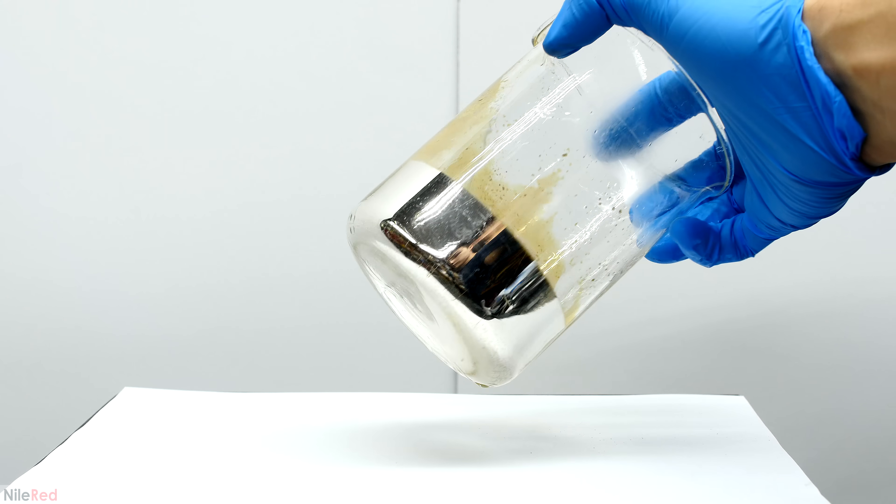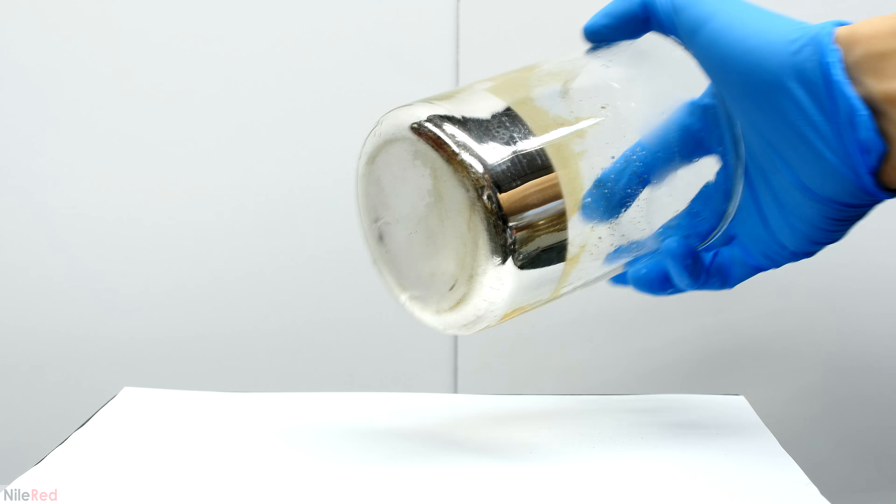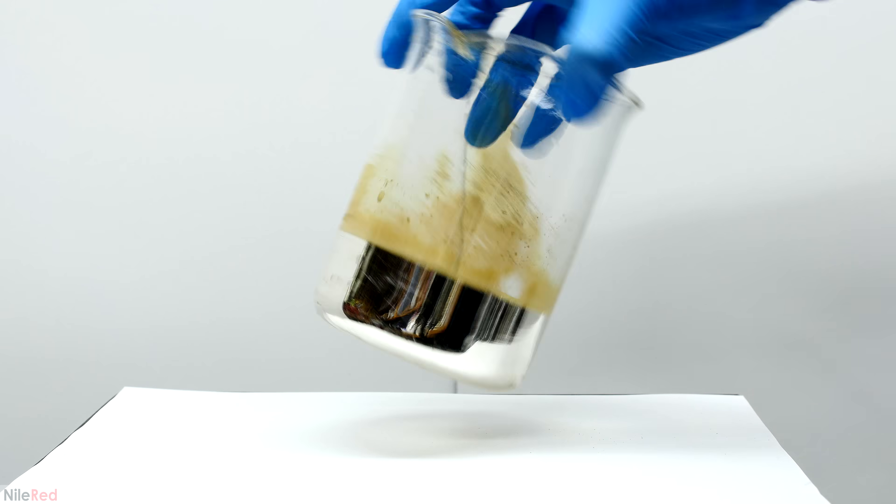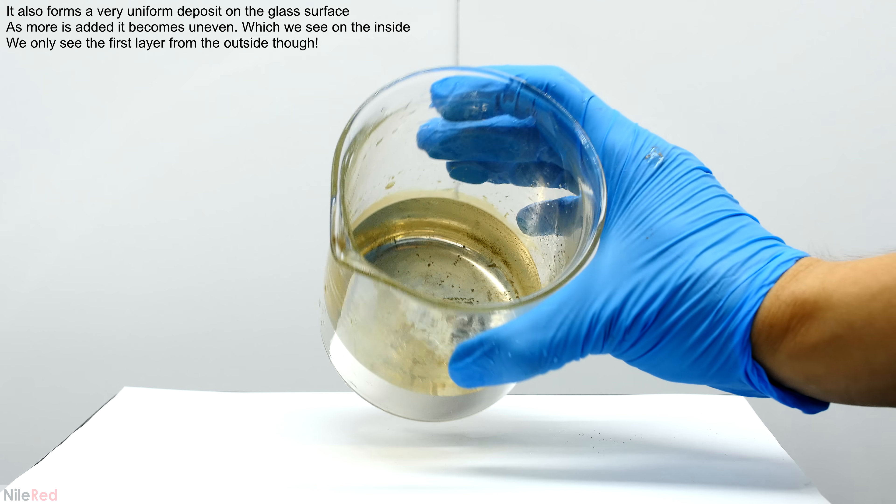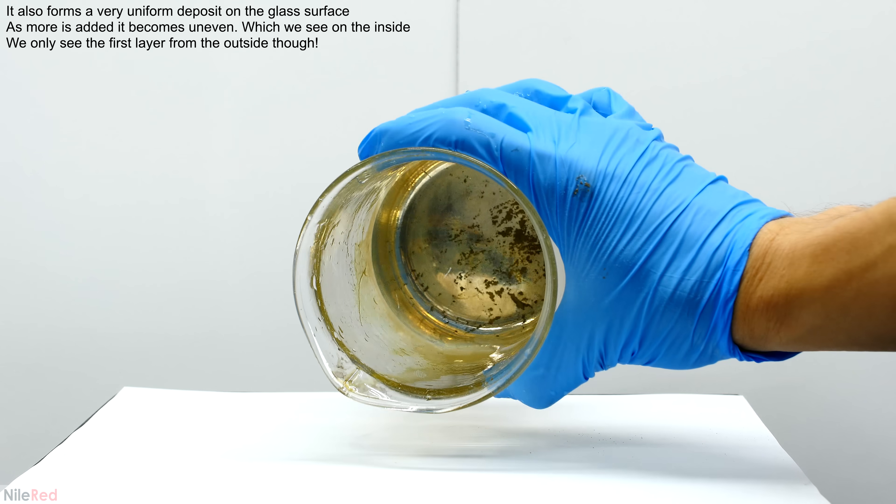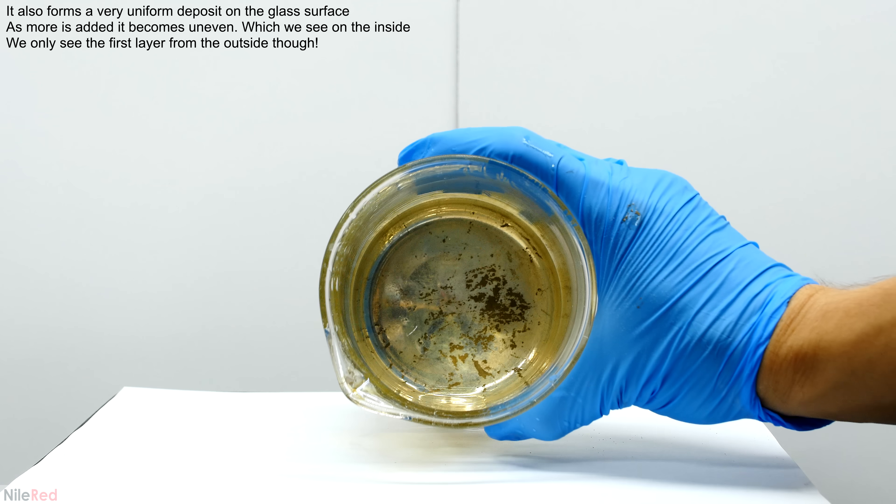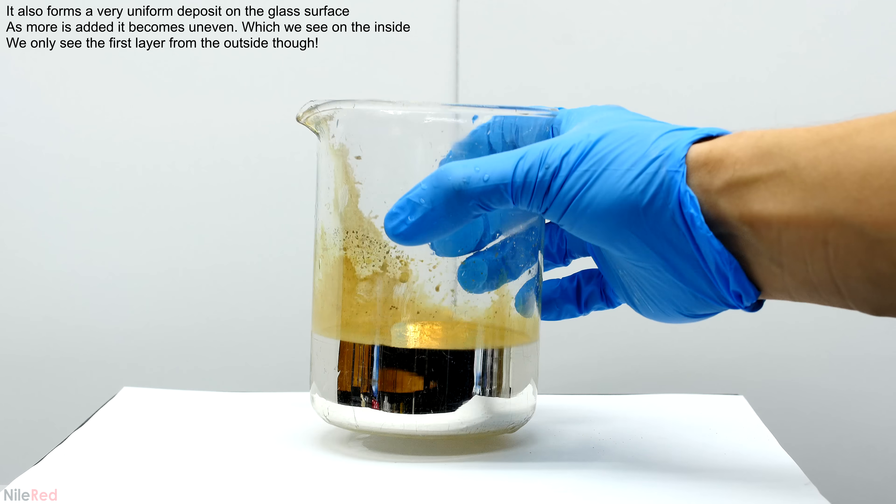When looking at it from the outside, the mirror is very nice, but when we look at the inside, it's kind of gross. The silver that we see in the beaker is exposed to air and it gets oxidized, but the silver that we see from the outside is protected from this and remains shiny.